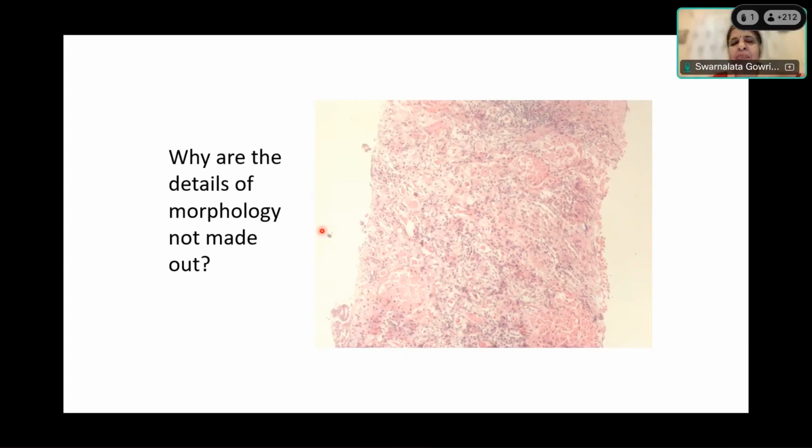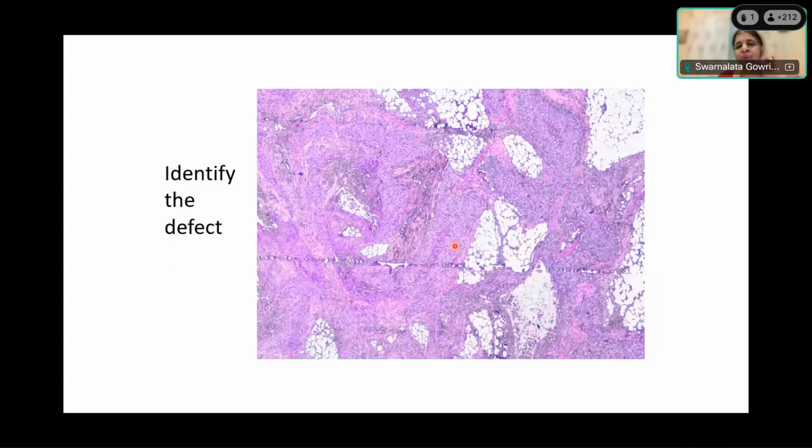You can do that experiment very easily. When you get a tissue, part of it which you think is not important, leave it out for some time, then process it, and then you will get this. So this was a tissue which was completely autolyzed. This was actually a post-mortem sample, and that's how we know for sure that this was an autolyzed sample. So again, autolyzed tissue will look like this and cannot be retrieved. Irretrievable errors.